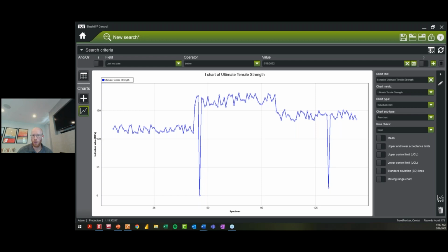The next one is, can I do mean plus or minus 6 standard deviations? Unfortunately, we are limited to 1, 2, and 3. So 6 is not an offering at this time. But like I've been saying, all of these features are very good to hear, and they're useful for me to capture and put on our backlog.